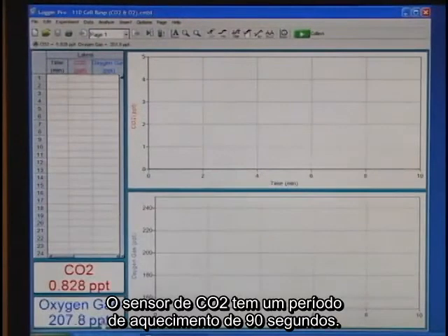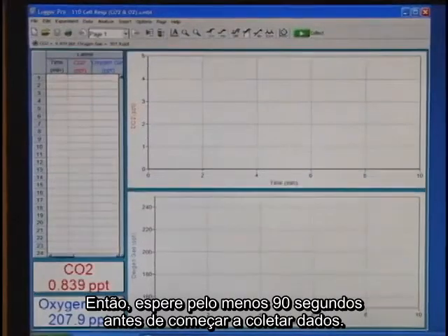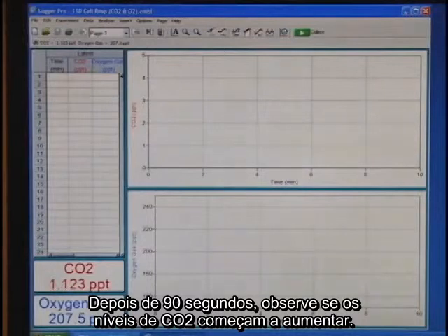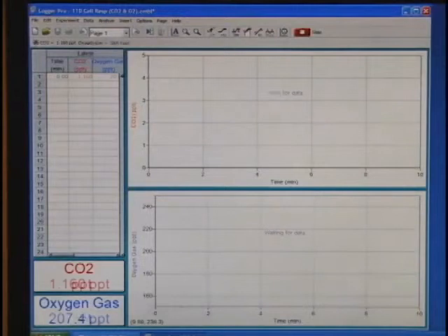The CO2 gas sensor has a 90-second warm-up period, so wait at least 90 seconds to begin data collection. After 90 seconds, watch the CO2 levels to see that they're starting to increase. If they are, start data collection.